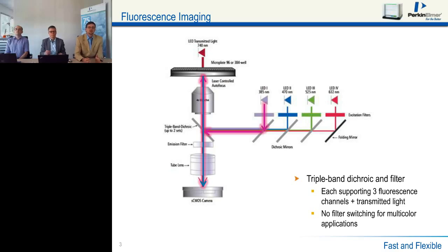The advantage of this approach is that we only have to switch between different excitation wavelengths to use multicolor assays. So switching from a single color assay to a dual color assay does not require twice the measurement time, but just the exposure time required for the second color. This has the benefit that we use about 4 minutes for a single color in 384 well plates, and only require about 5 minutes for the second color, so 1 additional minute in this case.